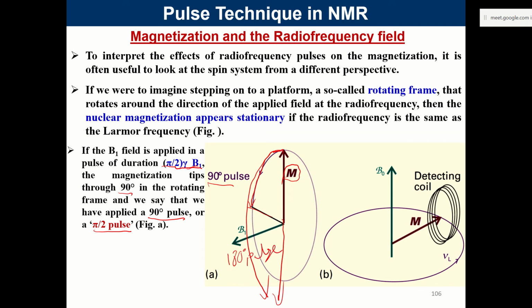So this will be a 180-degree pulse. So you understand the difference. And when you say a 360-degree pulse, then nothing is changed, the complete rotation. So you are not actually doing anything. So mainly you will find that application of a 360-degree pulse means nothing. It is not useful in the real sense. So this analysis is useful when you vary the pulse duration, 90-degree pulse or 180-degree pulse.